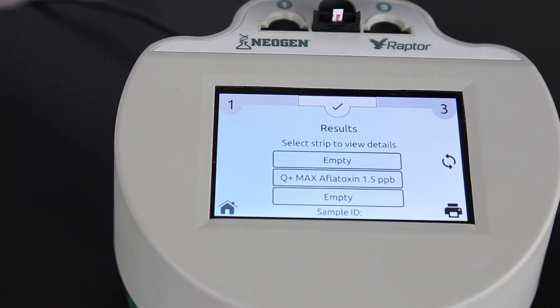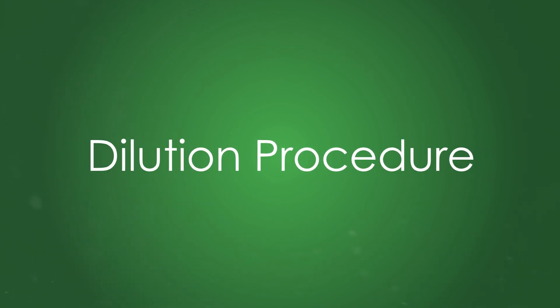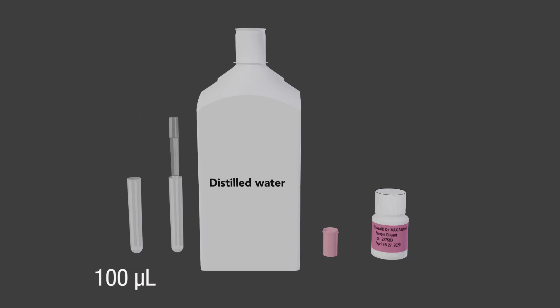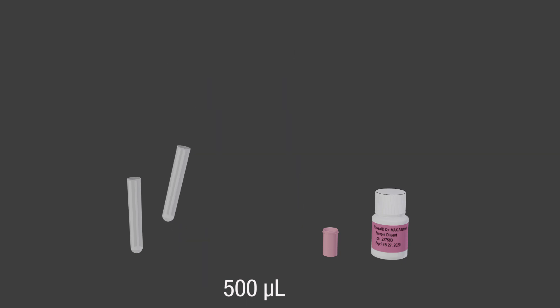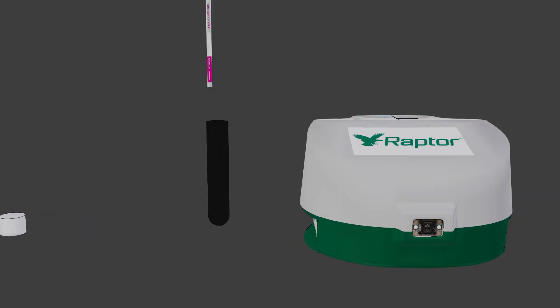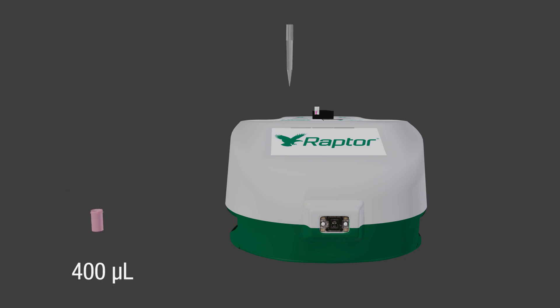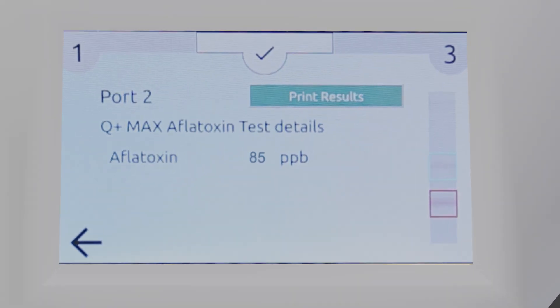For samples greater than 50 ppb, you will need to dilute and retest. Add 100 microliters of sample filtrate to a sample collection tube, add 500 microliters of distilled water, and mix well. Transfer 250 microliters of the sample dilution to a red dilution cup. Add 250 microliters of sample diluent and mix well. Place the Raptor cartridge into a port and add 400 microliters of sample to the cartridge. The result will be displayed. Remember to multiply your result by the dilution factor. For this example, multiply by 6.